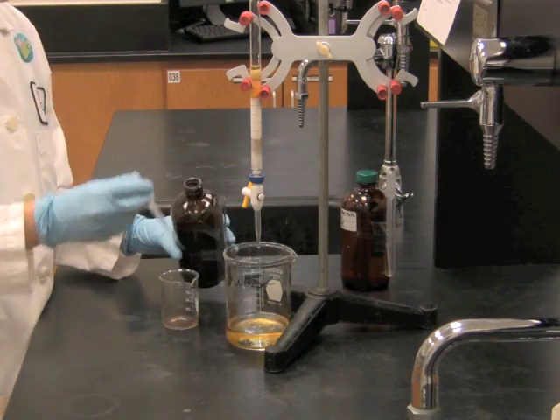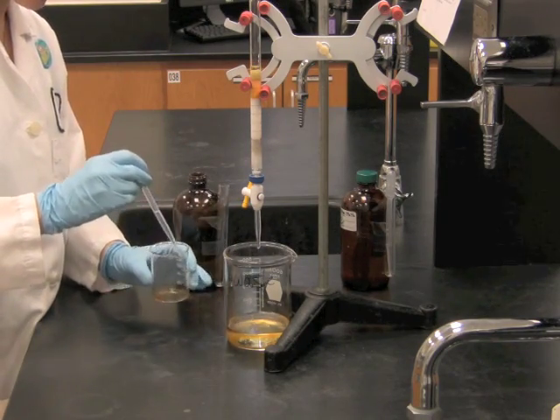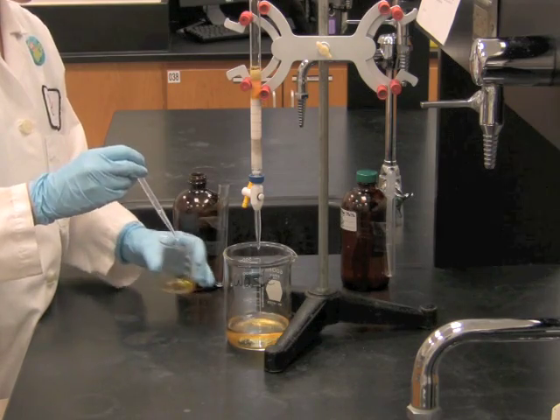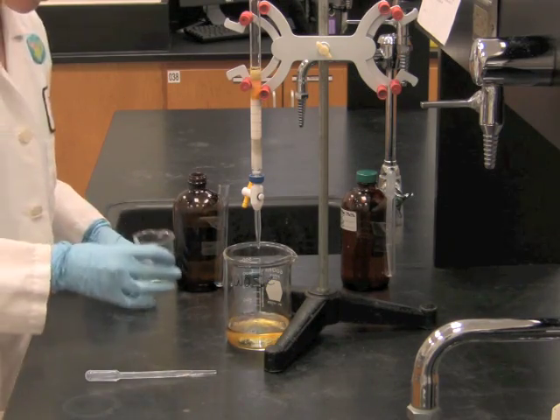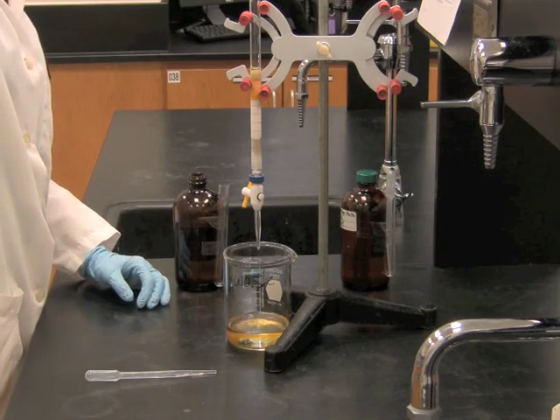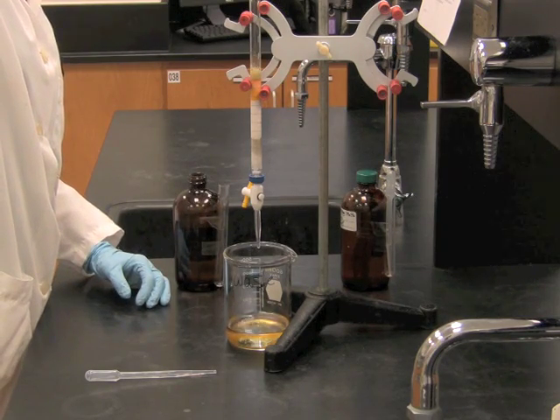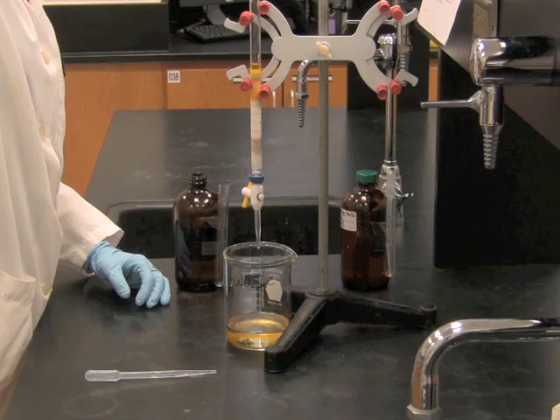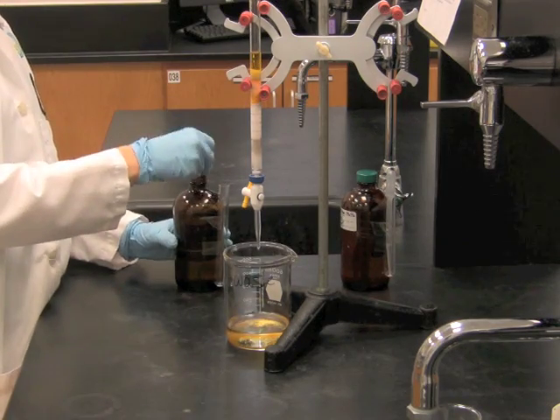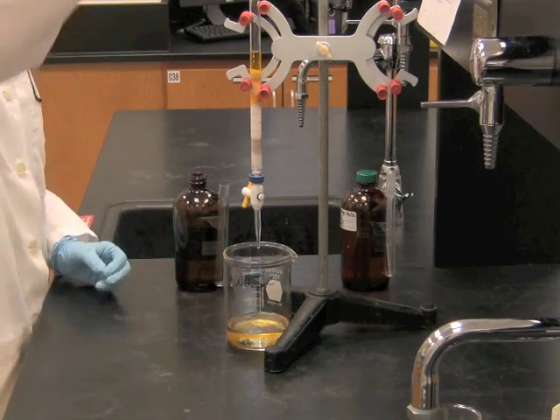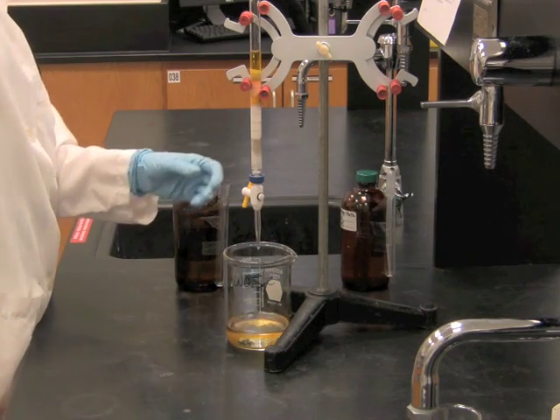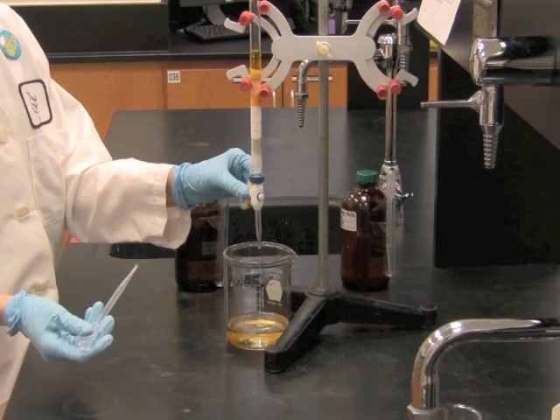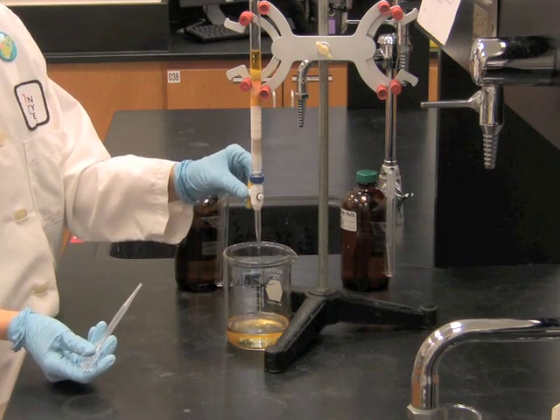We're going to rinse our beaker with a little bit of petroleum ether and add that to the column. Also wash the sides and inside top of the column with some petroleum ether and let this drain to the top of the sand.